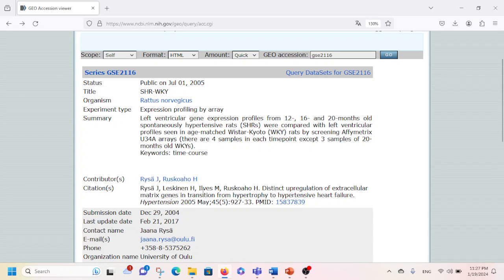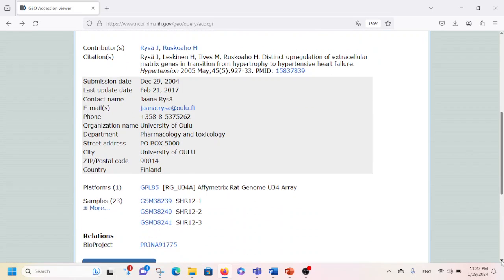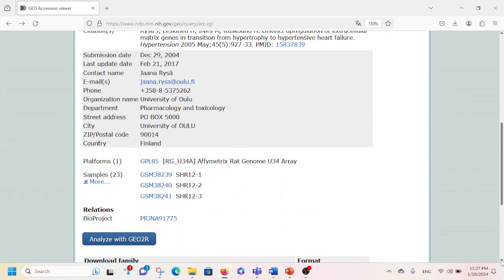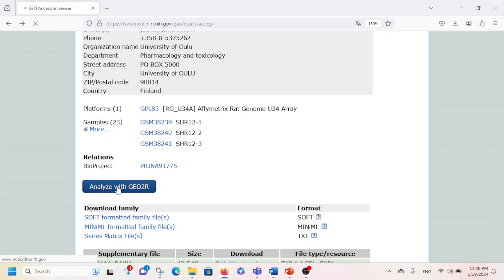You can see who contributed for this experiment, when was this submitted, and who is the contact person. Then you scroll down and go to the Analyze GEO2R section. You are going to click on Analyze with GEO2R.